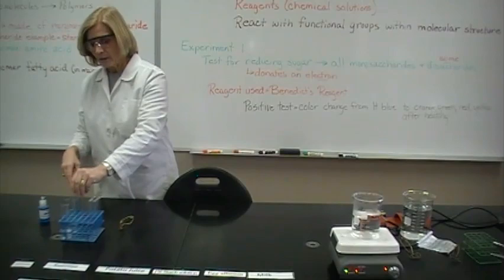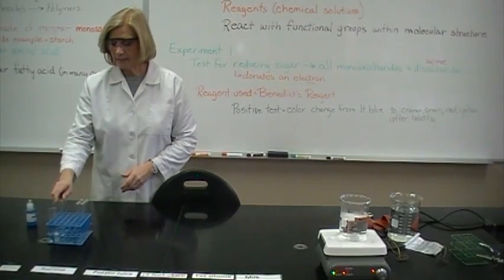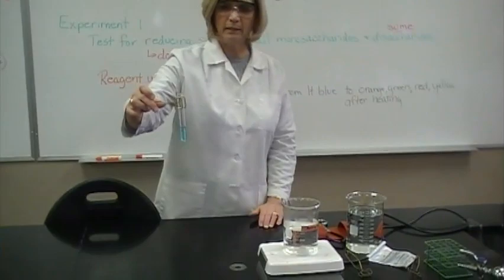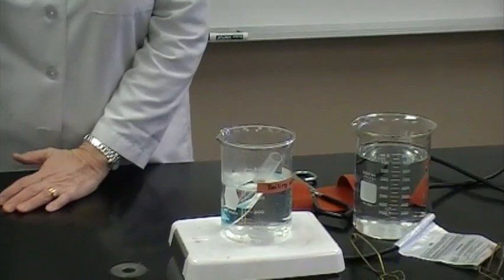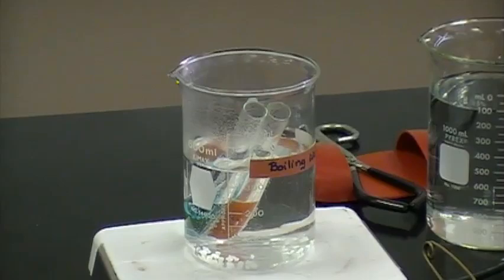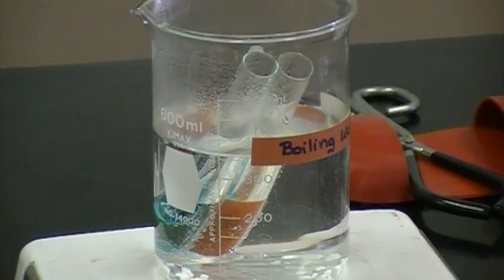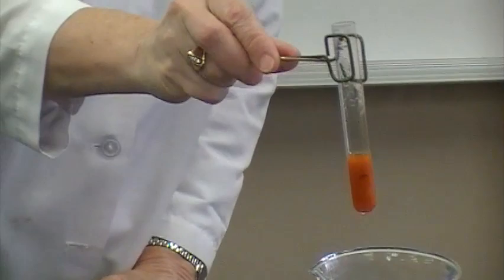Once you have your tubes mixed you can use a test tube holder. The test tube holder is a clamp that you squeeze and you will pick up your test tubes. You will set all eight of your test tubes in the heated water on the hot plate. In one minute you will see that the solutions have changed color. You will remove the tubes from the water bath.